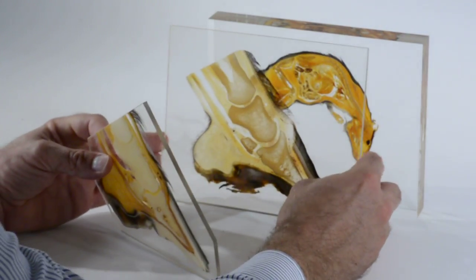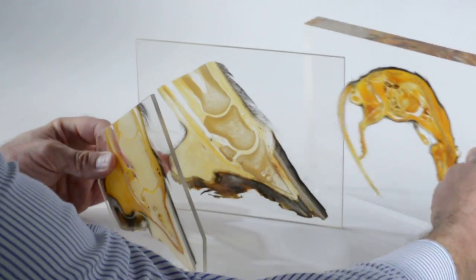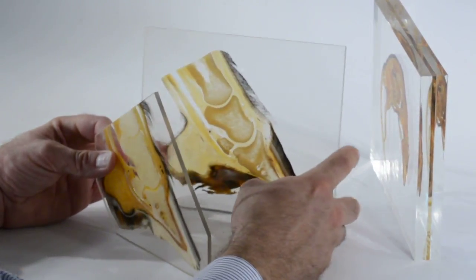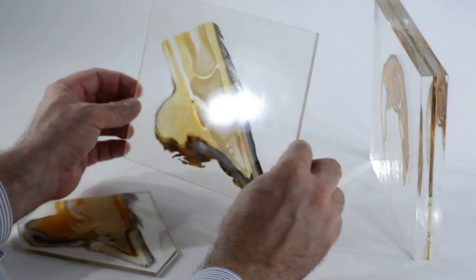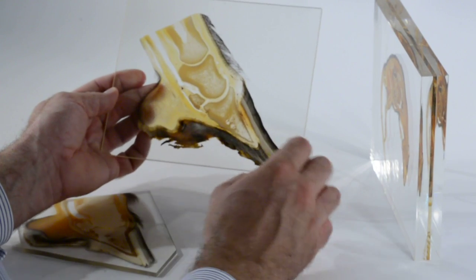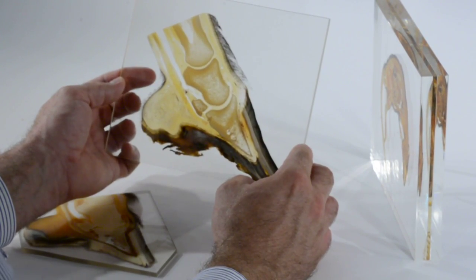Then there is the so-called sheet plastinate without acrylic, and the sheet without acrylic is, as you see, just the plain slice, usually in a rectangular form, not necessarily.